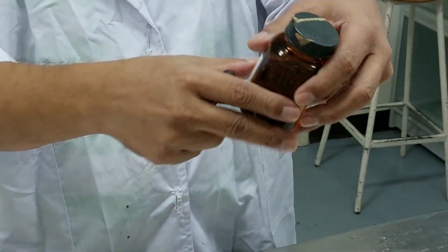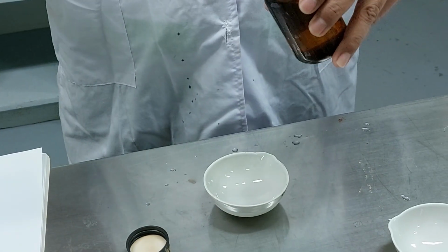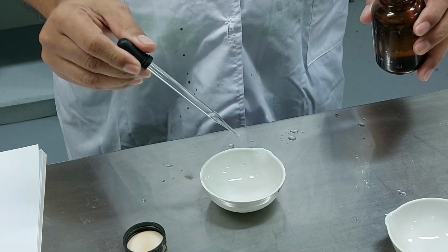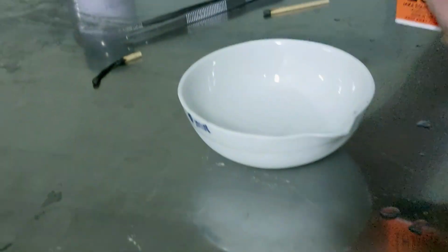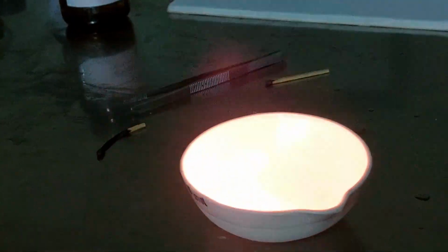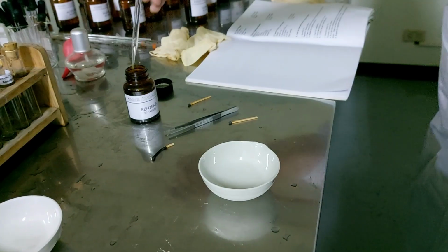First, we have hexane, and observe the flame as well as the smoke. Okay, this is hexane. So observe. That is hexane. Observe the flame. Now let's go to benzene. We're going to place 3 drops also.